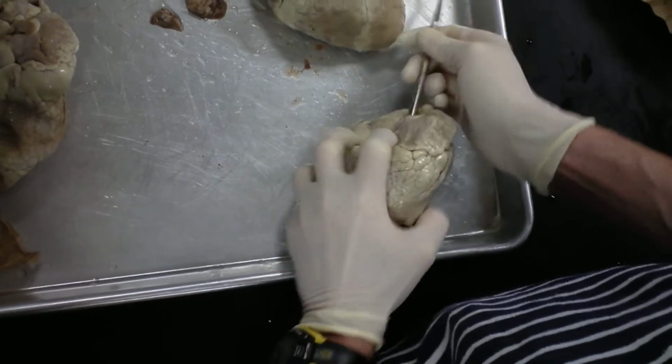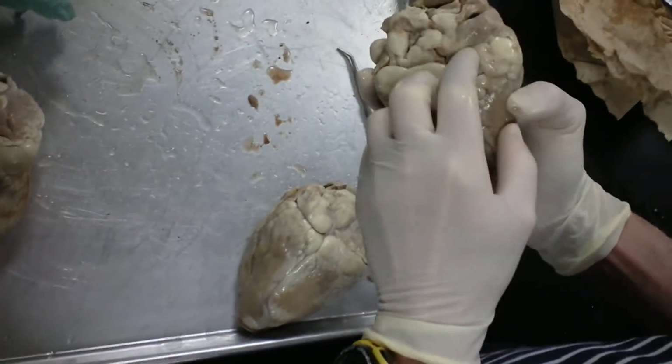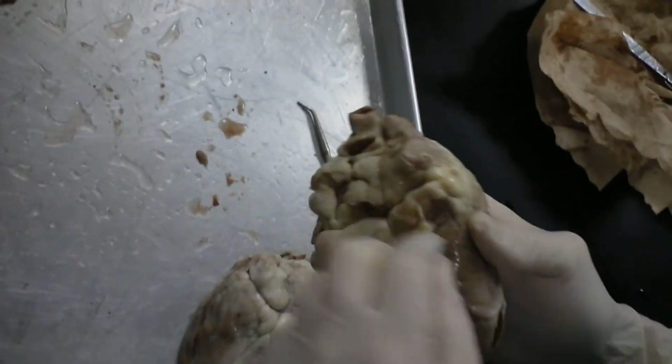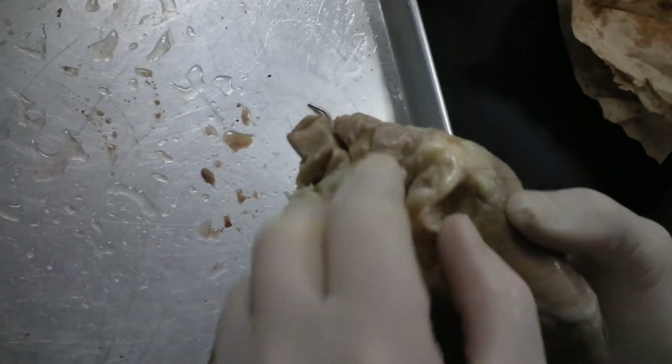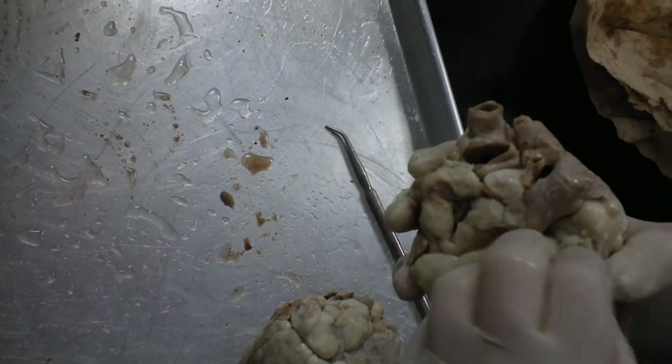And I don't see the inferior vena cava on any of these. I don't think I did. No, but you saw the superior one. Wait a minute. That's fat. That's fat.